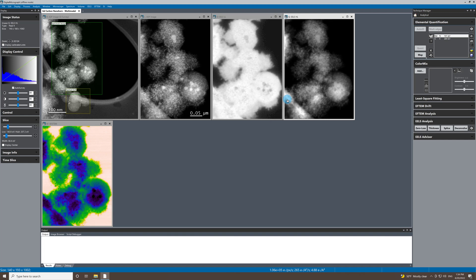The experiment was performed at 80KV, so I chose to use the Stellar camera, which uses the Dectris-LS sensor. The sample I'm looking at is gadolinium-treated carbon nanohorns, and they were drop-cast onto a holy carbon support film.